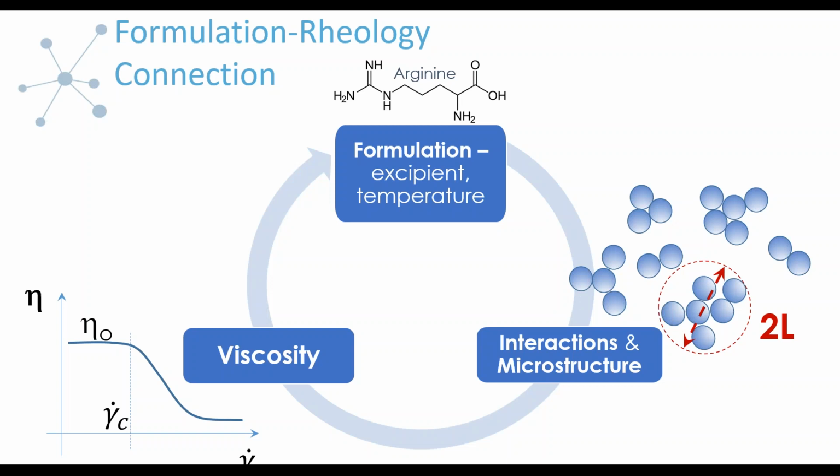The first thing I wanted to remind you of, and here's where I'll introduce our new formulations that we're going to analyze today and how they're different than the ones we've done in the past, is the connection between formulation and rheology, and in our case specifically viscosity, though it applies to rheology in general.